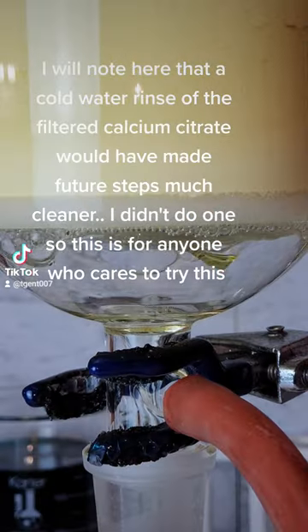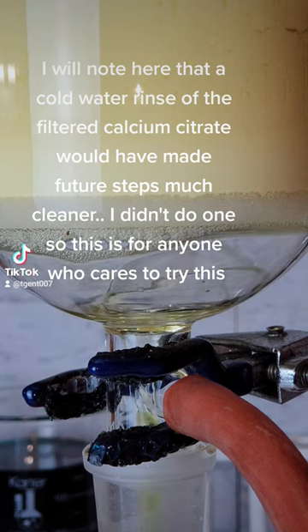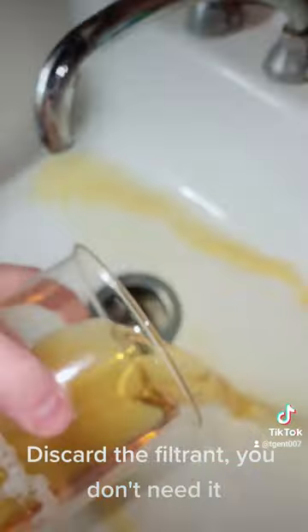I will note here that a cold water rinse of the filtered calcium citrate would have made future steps much cleaner. I didn't do one, so this is for anyone who cares to try this. Discard the filtrant — you don't need it.